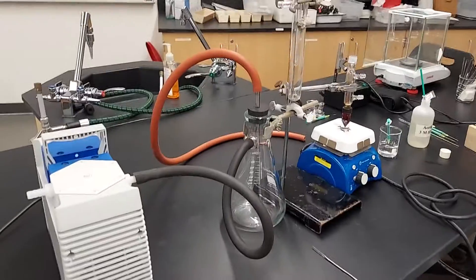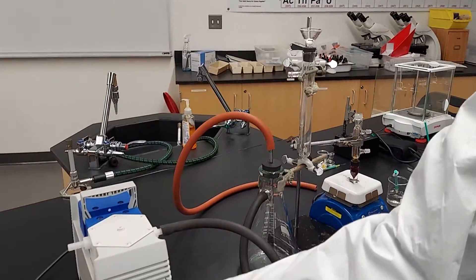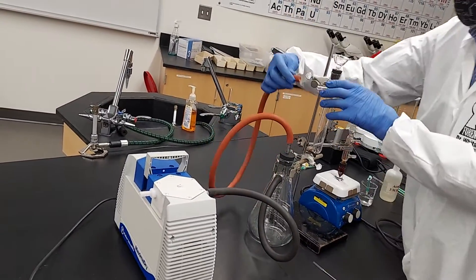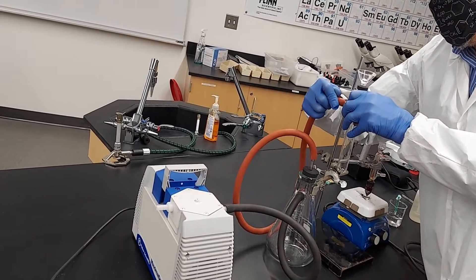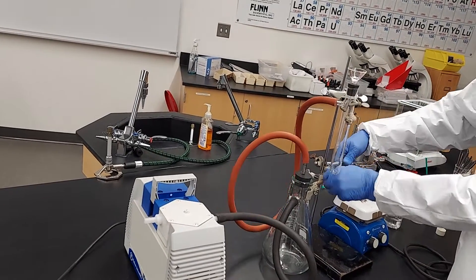We're supposed to put our sample under suction filtration. Turn the pump on first, then engage it. All right, nice and tight — that's good. And we need our flask.